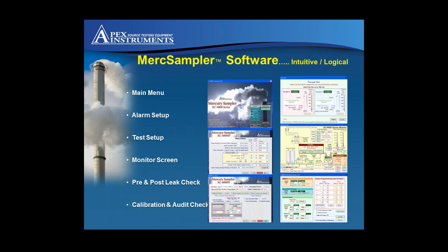So we'll pause the system. That's for the analog side of it. And then of course you choose your proportional. If you're going to do constant, you have a little drop-down menu there to choose from, and then you can do 1 to 10 volts, 4 to 20, or you can do Modbus as far as your proportional. The continuous, or constant, is fairly straightforward. You just choose constant, and for reference you can choose your acronym for your stack flow. You're going to do KSCFM or whatever you want to use there. And that is only stamped into the data. There's no calculation done with that at that point.